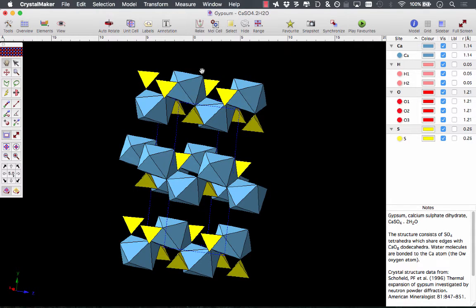Much more simple. That said, it is a representation and obviously we are losing some information. If you were looking at a simple crystal structure, something that was fairly densely packed, for example the rock salt structure as evidenced by some alkali halide materials and other materials, you might use balls and sticks because with the density of the structure you would lose a lot of information and mask a lot of information by filling the whole space with polyhedra. But for a complex crystal structure like this gypsum, the balls and sticks view is just too much, and it's much more useful to view it as polyhedra instead. The polyhedral view highlights the packing, the layering arrangements, for example.